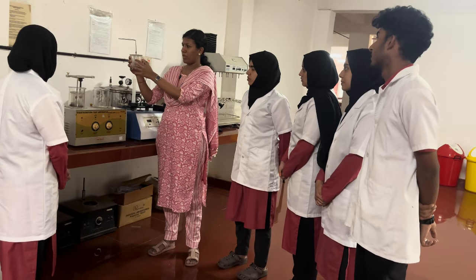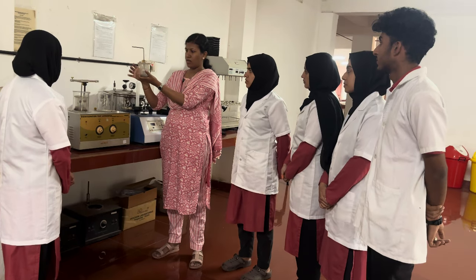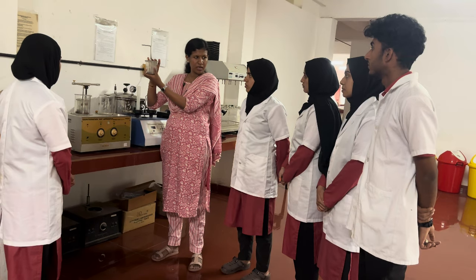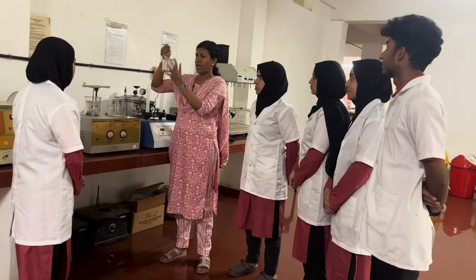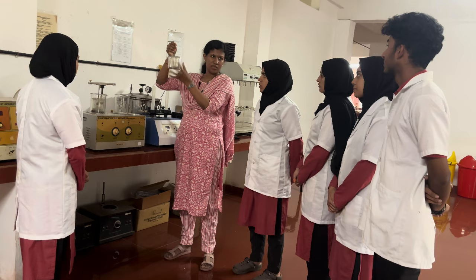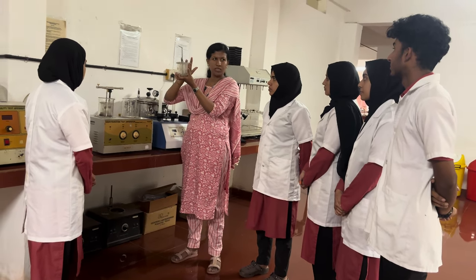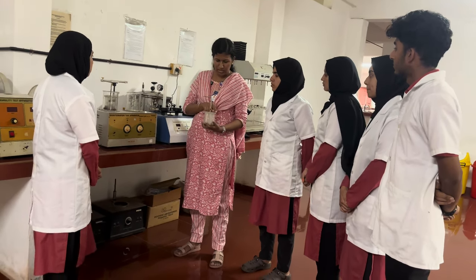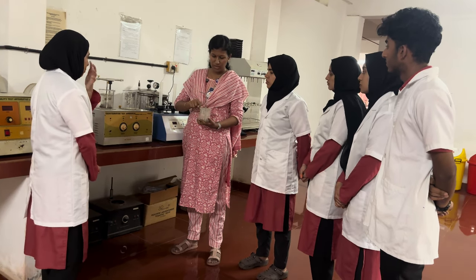You can see how many test tubes there are. Six glass tubes. Okay, six glass tubes are placed within two superimposed transparent plastic plates. There are two transparent plastic plates placed at the top and bottom of the glass tubes. So these glass tubes are held in a vertical position with the help of these two transparent plates. And you can see the holes.